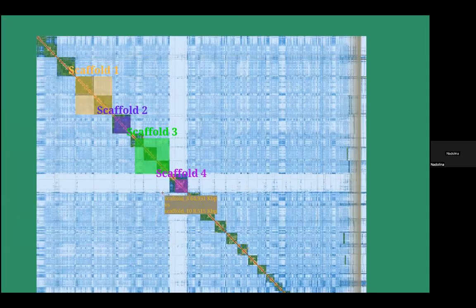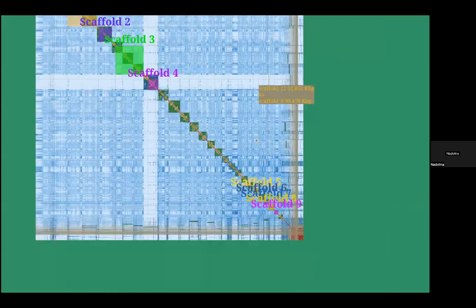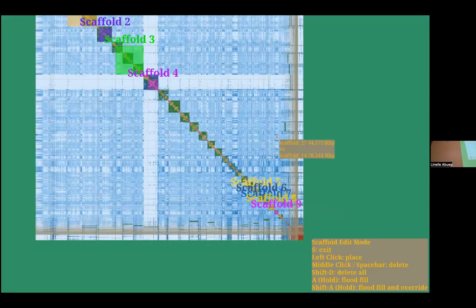But a pretty good indication. No, it's all highlighted. Okay. A good thing is if you mess up the highlight, because it is very finicky here, this scaffold painting mode, it's annoying, and you're probably going to mess it up and have to do it a couple times over.